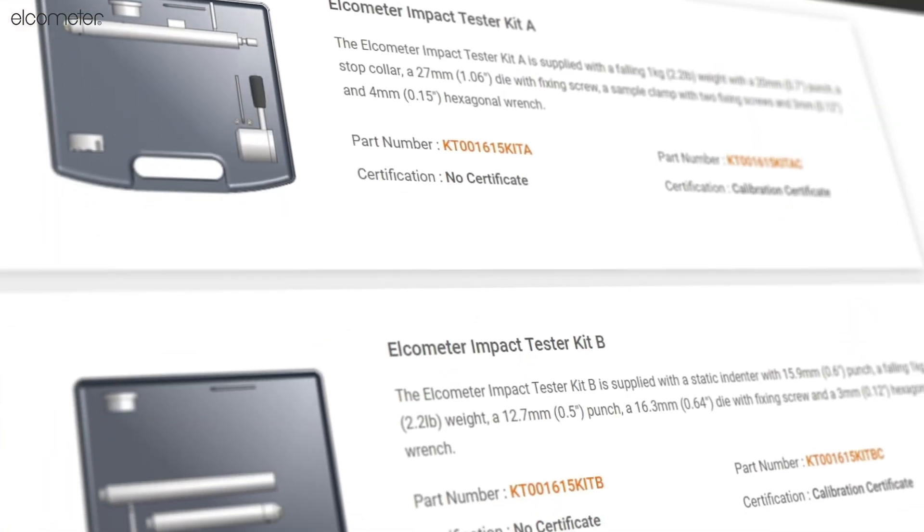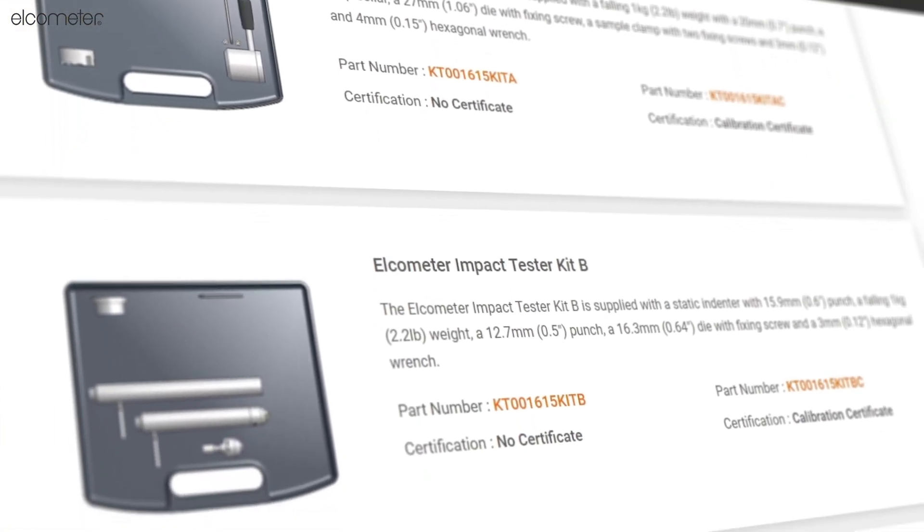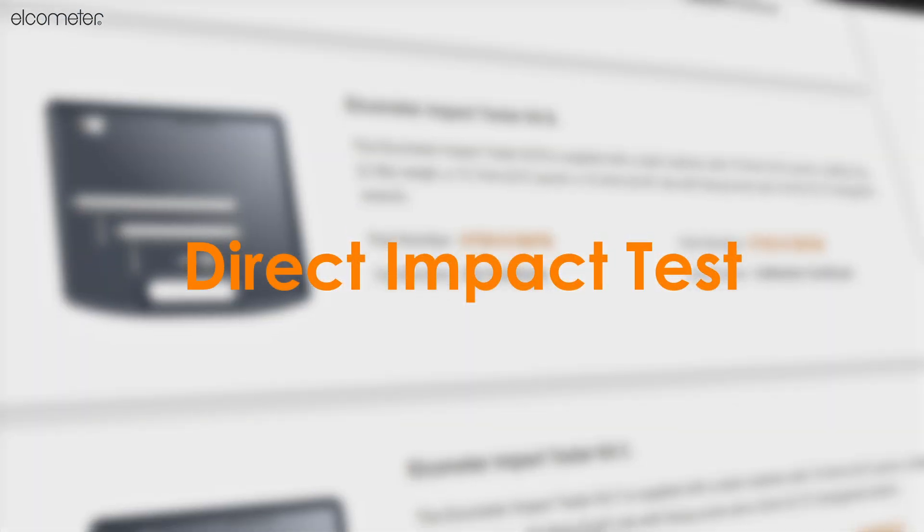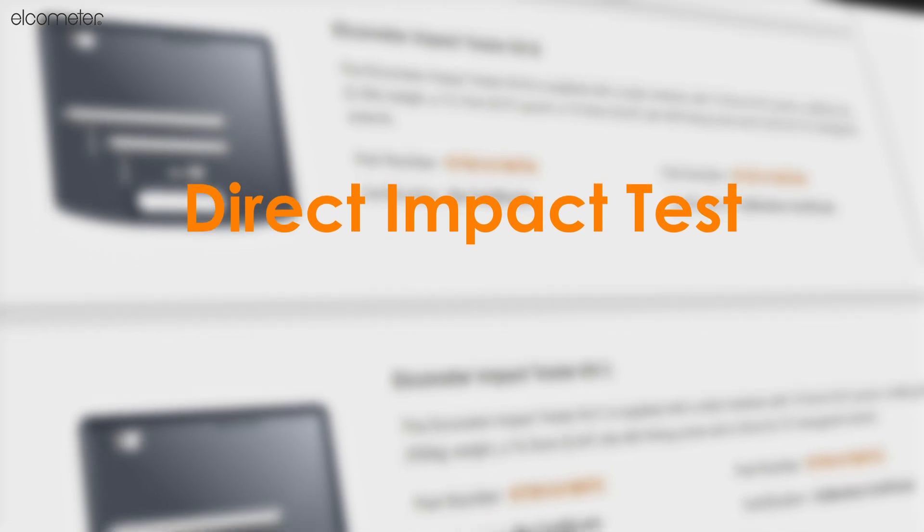Depending on the standards you are working towards, you have the option of 7 different kits providing functionality for testing towards various methods. Every available kit can be categorized as falling weight, known as direct, or resting weight, known as indirect.